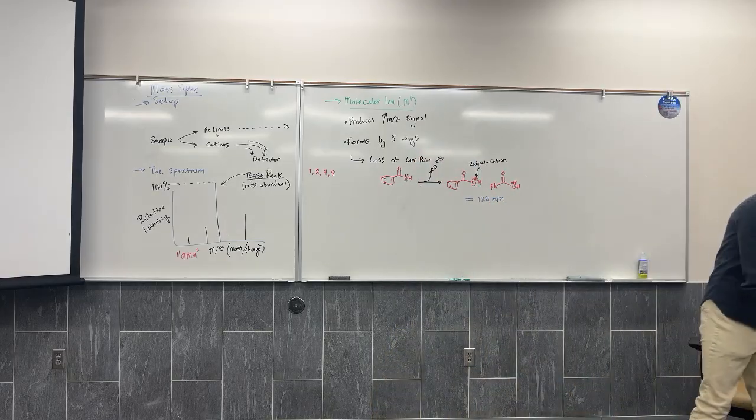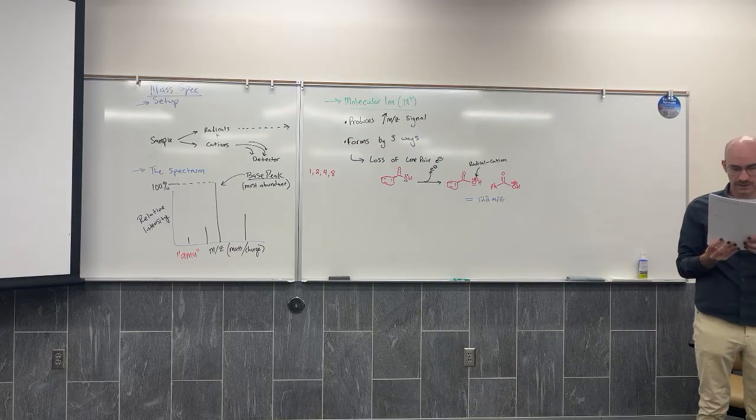Let's look at the spectrum. Do we see a signal at 122?